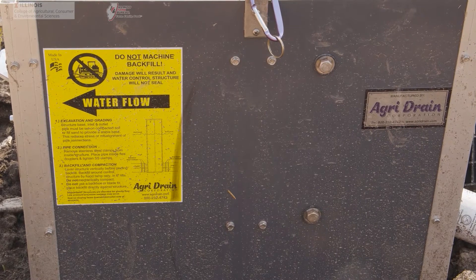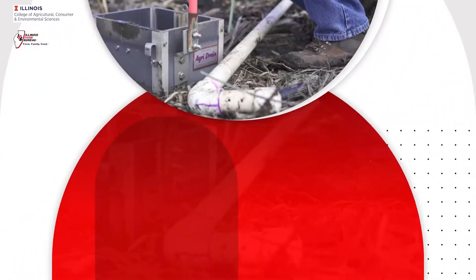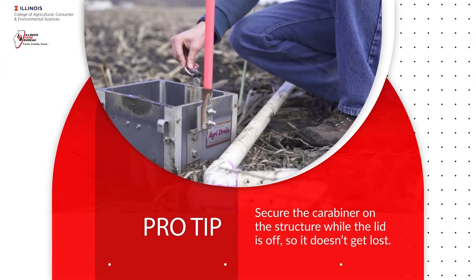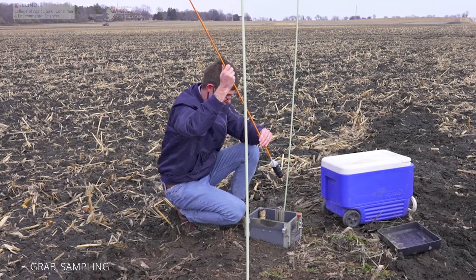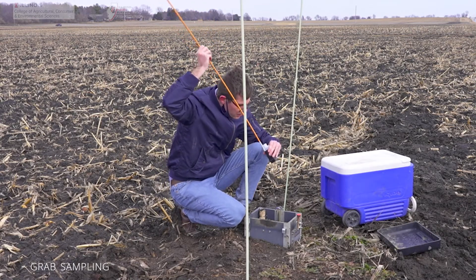Control structures provide an ideal access port to sample both the tile drainage water flowing into the bioreactor and the tile drainage water flowing out of the bioreactor. In the process of grab sampling, we use a bottle on a stick to collect a water sample.